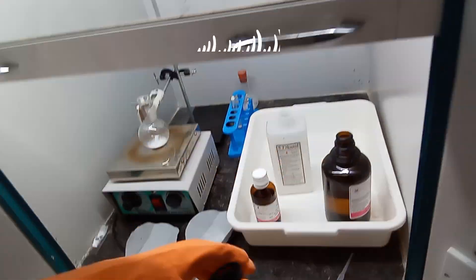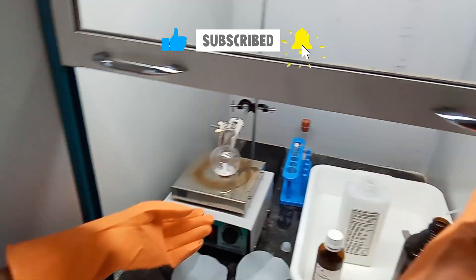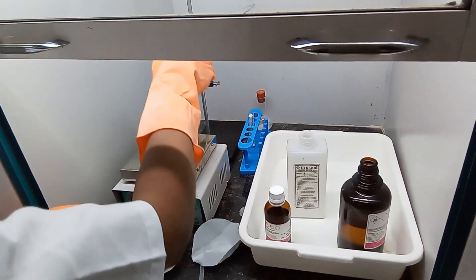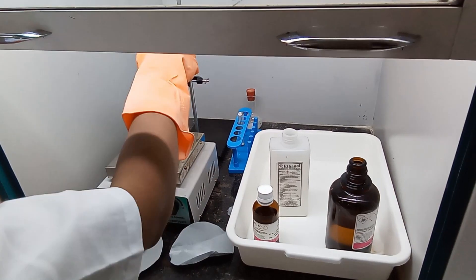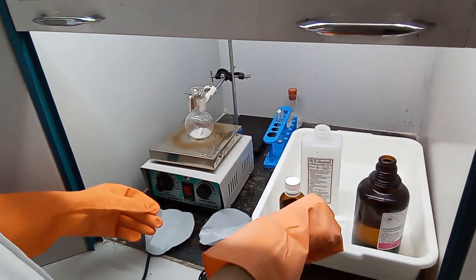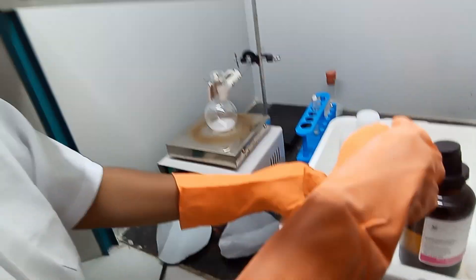Afterwards, the solvent DMF and ethanol is added. Stirring is then started. And finally, some triethylamine is added.